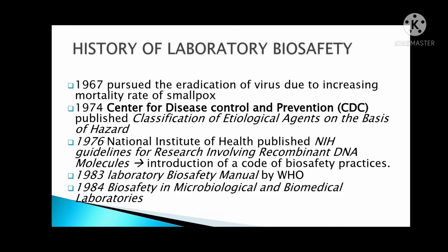That was also in 1984. These mark the development of the practice of laboratory biosafety. If you wish to read more regarding the classification of etiological agents on the basis of hazard and also the NIH guidelines for research involving recombinant or synthetic nucleic acid molecules, I will be providing the websites that you may read to feed also your curiosity.